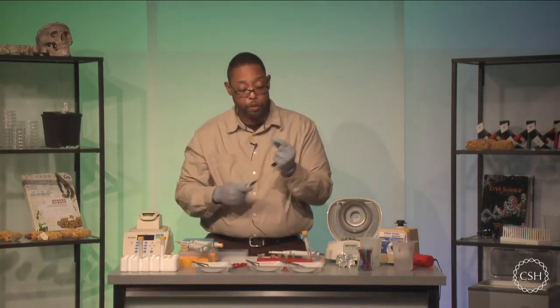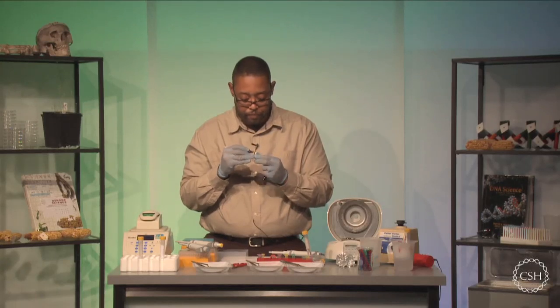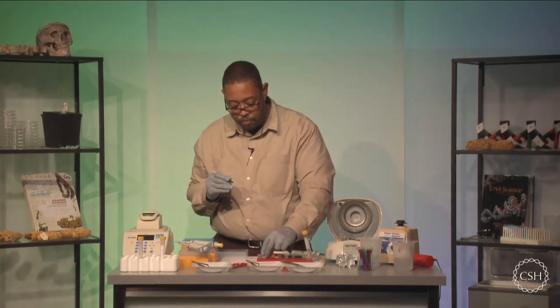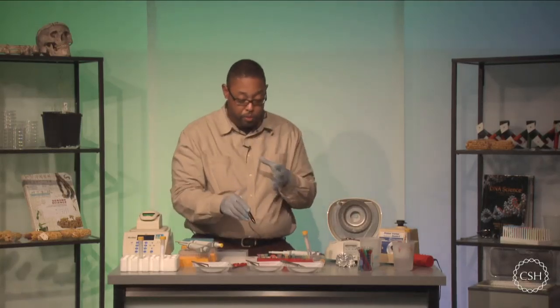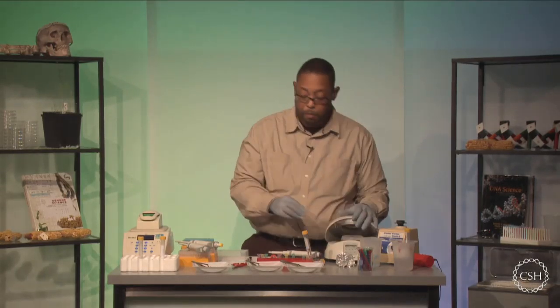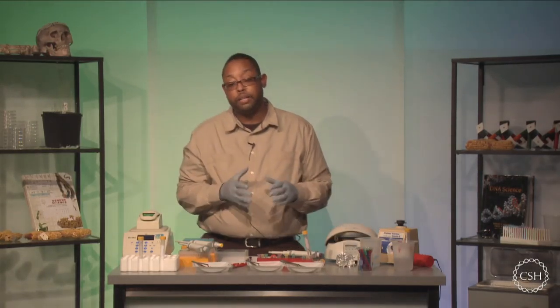And this is going to be my sample number 3. And this is my insect. All right, so I have my 3 test tubes that have my essential supernatant that I need, and it has my DNA inside of there. So now I need to go and collect that DNA.